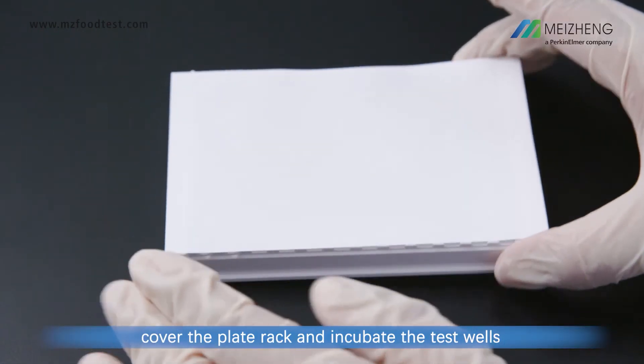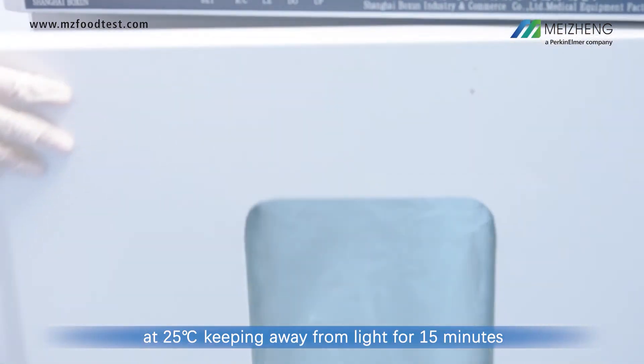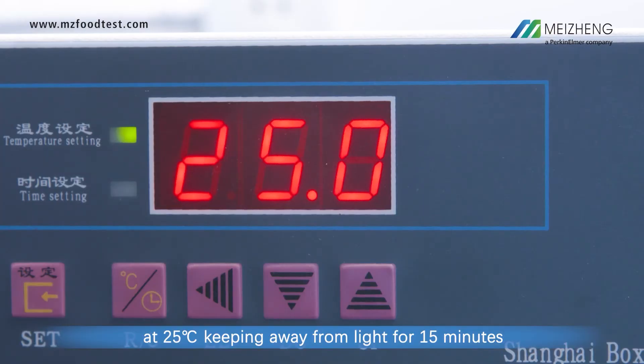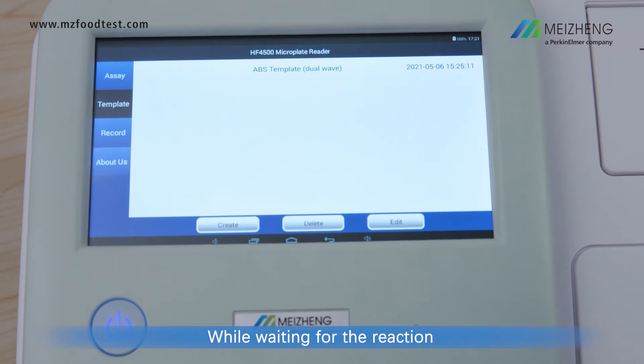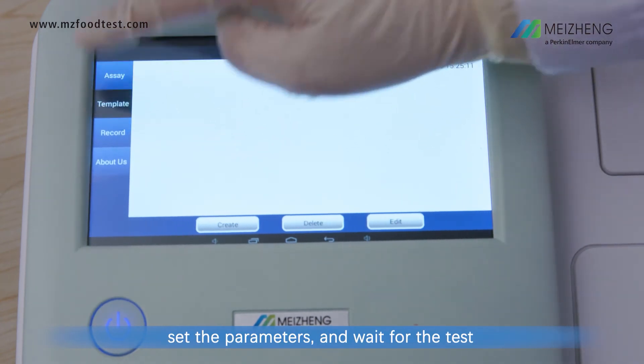Cover the plate rack and incubate the test wells at 25 degrees Celsius, keeping away from light for 15 minutes. While waiting for the reaction, turn on the HF4500 microplate reader, set the parameters, and wait for the test.